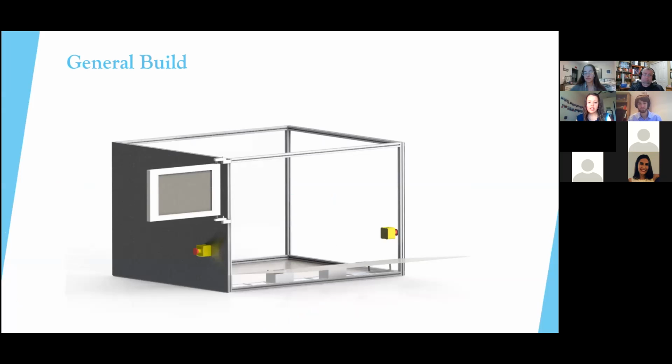Second, we have our adjustable digital readout on the left-hand side of the general build, which will display the results or display what the progress of the experiment is, or display if there is an error of sorts. And we also have an oven-style door that will allow the researcher to easily insert the well plates filled with the microbiological subsystems. And with that, we will pass it on to Daniela Myers.